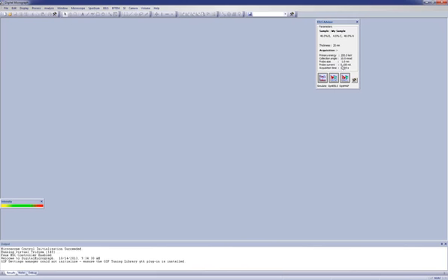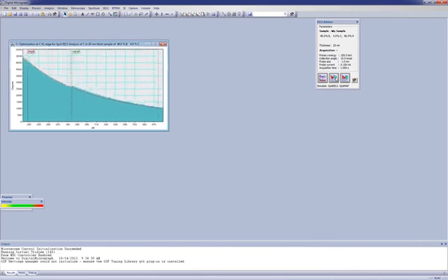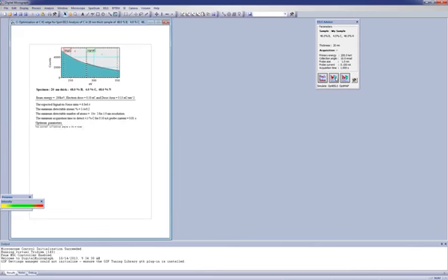Let's operate with the acquisition conditions that we already have. We know that our sample is fixed, and we can go ahead and hit the OptiEELS button. So in this case, what's happening is that the software is going through multiple iterations and coming up with a configuration of acquisition and processing conditions that maximizes the signal-to-noise ratio at the carbon K edge.